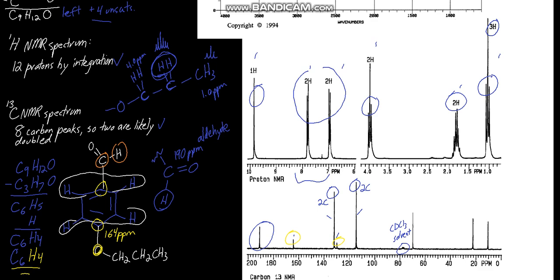The other major take-home message is you cannot avoid knowledge of splitting. As you note, this is the only kind of information we have that actually enabled us to connect these different pieces together. The splitting information. It's the only connectivity information. The rest is just lining things up and using logic. So there's more sophisticated NMR methods out there. I'll be teaching that course in the fall, actually.